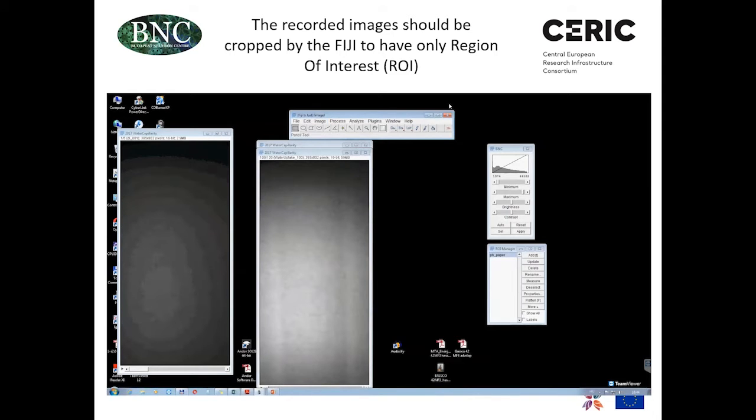And this is already created for the entire stack. So if you make this cropping, then all 100 subsequent images will be cut to size and they will remain equal. So that's very important, that the coordinates that you determine from one pixel would be identical to the other.